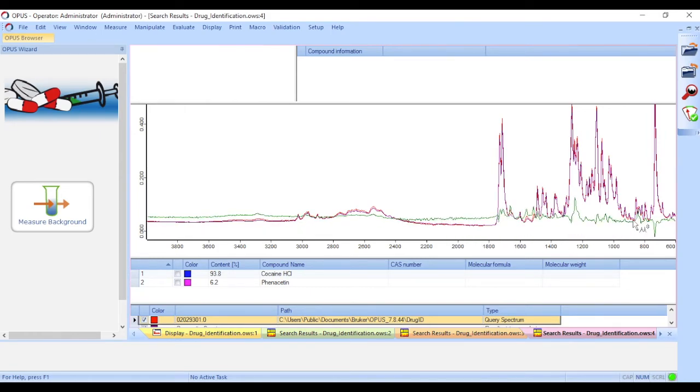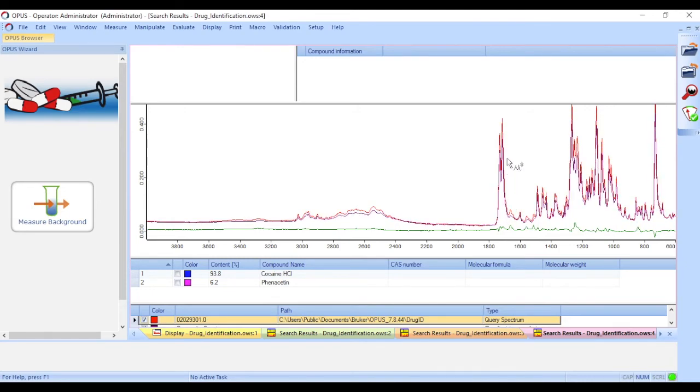So how do we interpret this information? Well, from this particular mixture analysis, you can see that the composite, which is the purple line, and our spectrum, the red line, are very similar. This is also indicated by the green line being pretty flat, showing us that there is very little difference between the two spectra. This means that the composite spectrum is a good recreation of our spectrum, and therefore the mixture analysis was a success and pretty accurate.